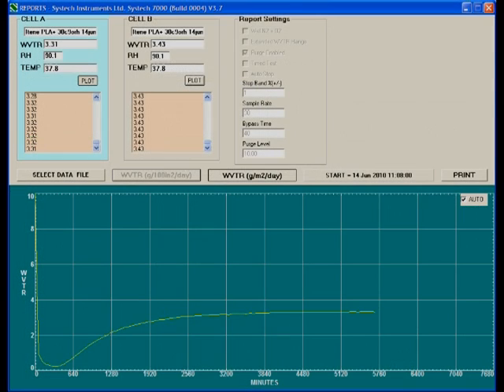Here you see the scrolling results in the two boxes at the top of the screen, and the live graph of results at the bottom half of the screen.